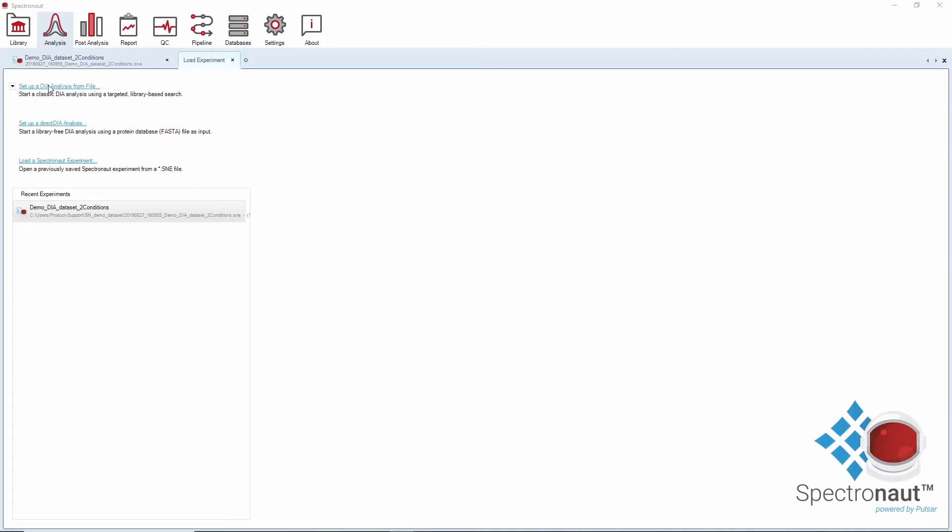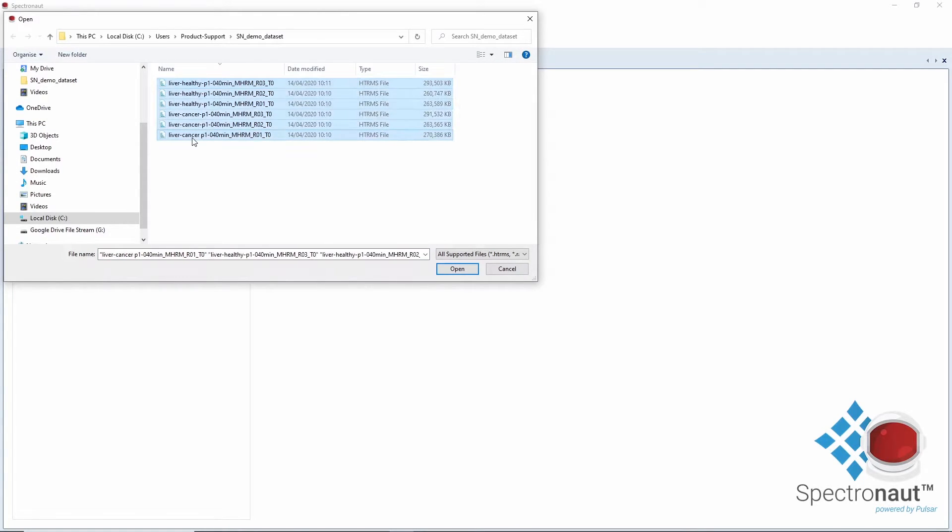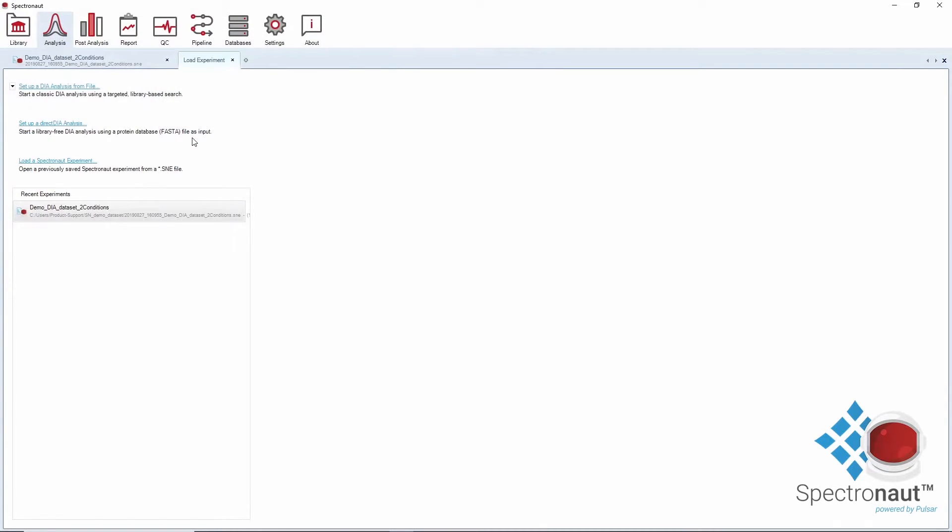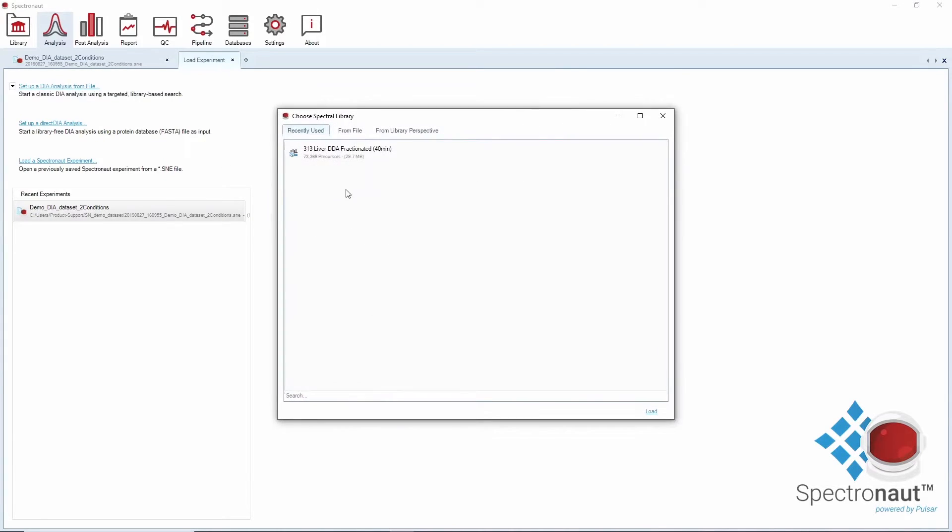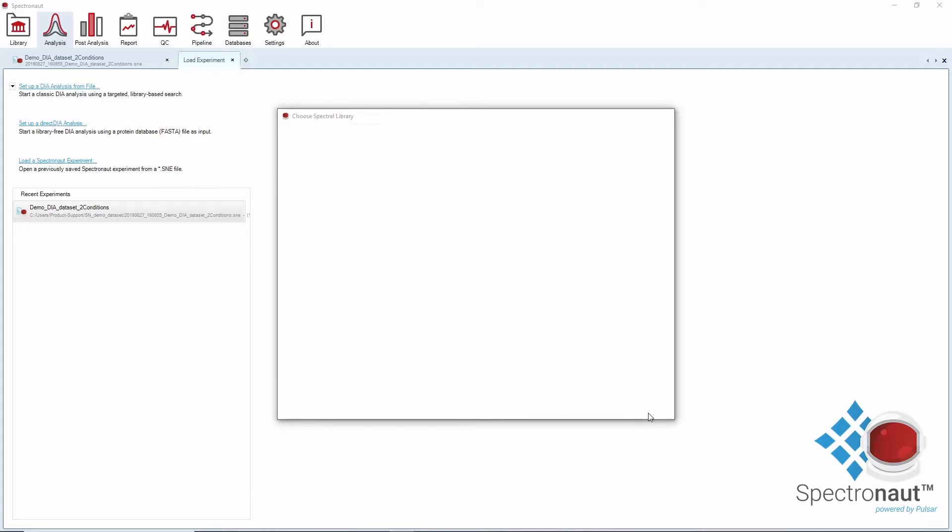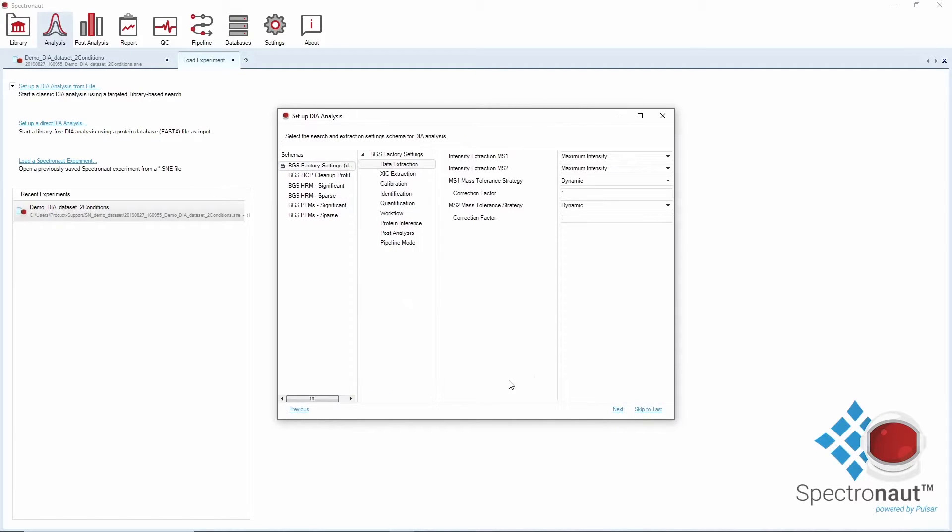By clicking on any action, a wizard will open. First, you will select your DIA runs and assign a spectral library. You will then define your analysis settings. We have pre-made setting schemas that you can use to start your first analysis.